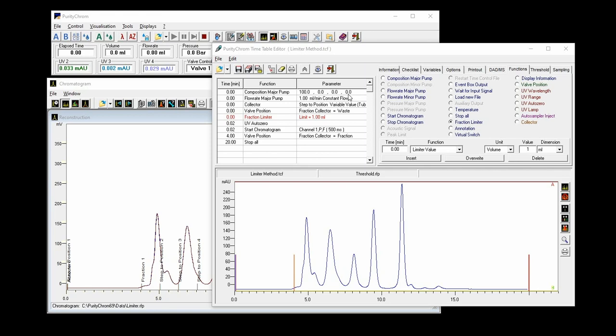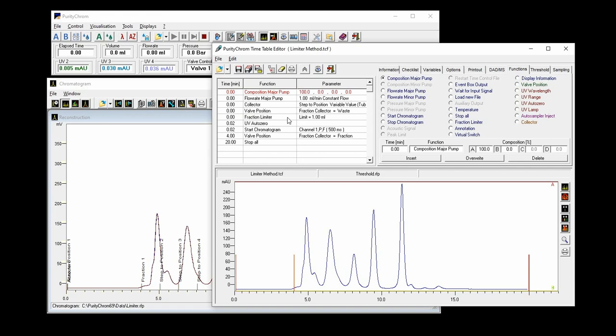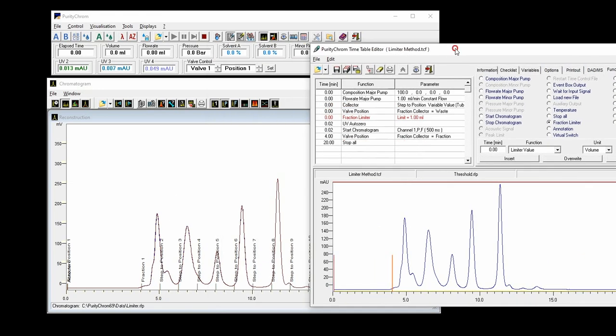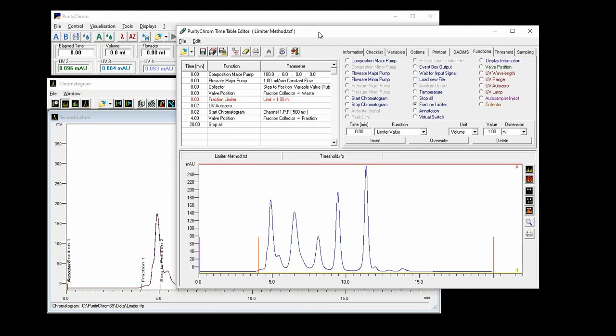The limiter you would use in a method in this way: you are starting to set up your method as you are used to. You basically set the flow rate and the composition of your pump, you set the valve positions, the collector, and then what you are doing is you define the volume that is used for the limiter calculations. I would go into the next tube in my fraction collector after one milliliter. And this will be triggered by setting the fraction collector into fraction. As you can see here at time point 4 minutes, we set the fraction collector into fraction and then from here on each milliliter we will go to the next position in our fraction collector.